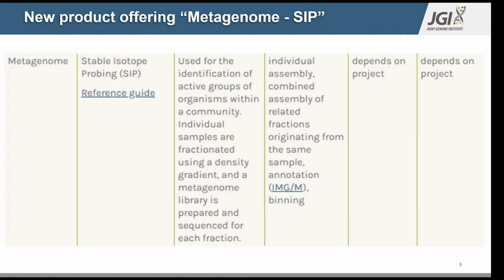really touches on 3 milestones within the JGI strategic plan, which started with a pilot SIP viral metagenomics project, which then sort of paved the way for providing user access to metagenome SIP capabilities, which is what we're focusing on currently. And then shortly after, we'll eventually be able to provide user access to metatranscriptome SIP capabilities.